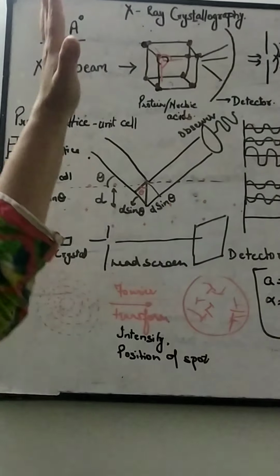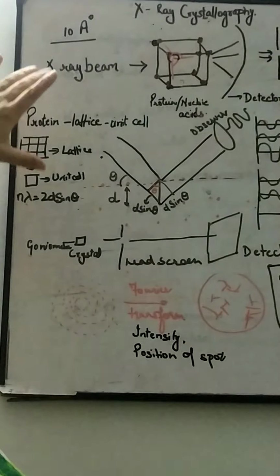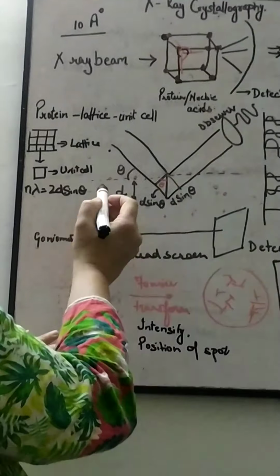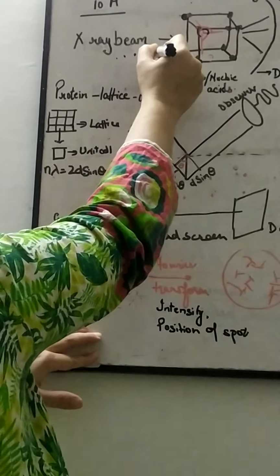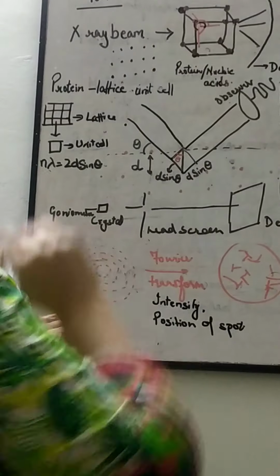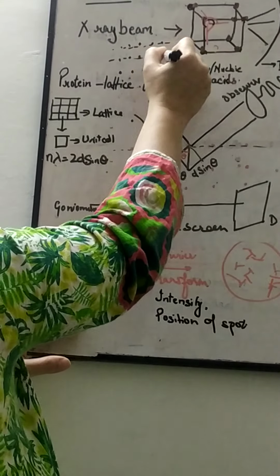Now all these crystals will have different types of X-ray diffraction patterns. Now why can these molecules be used for X-ray diffraction studies? If we consider that these molecules or crystals are arranged like this, so if we represent the different atoms of a crystal or of a unit cell like this, each of these is representing a separate plane.